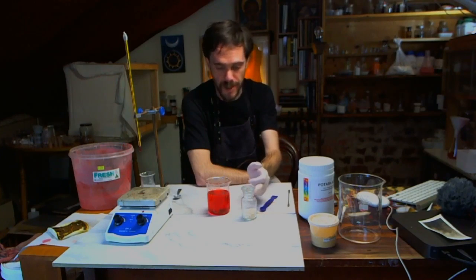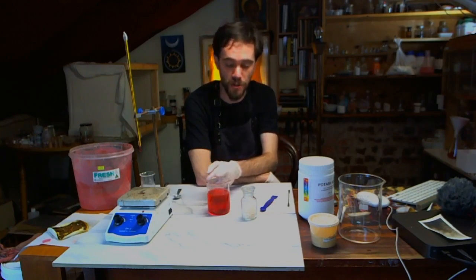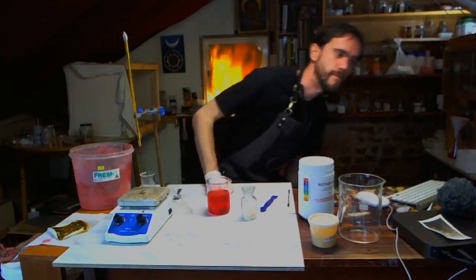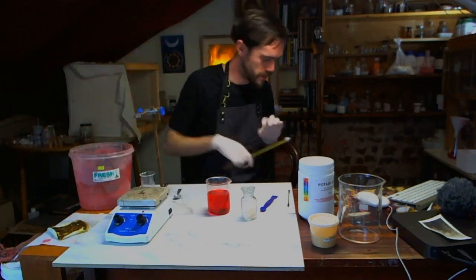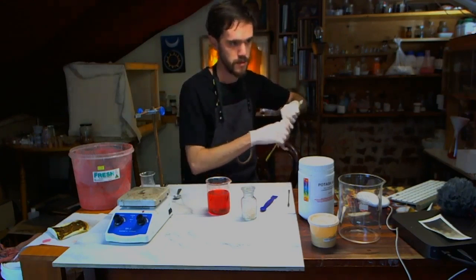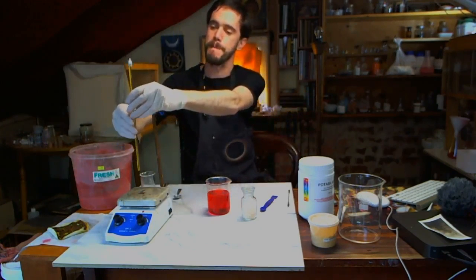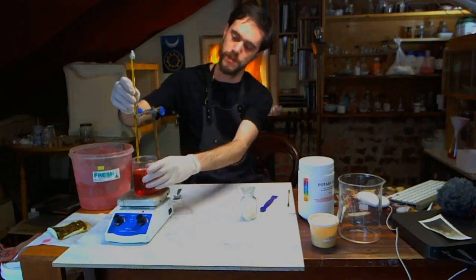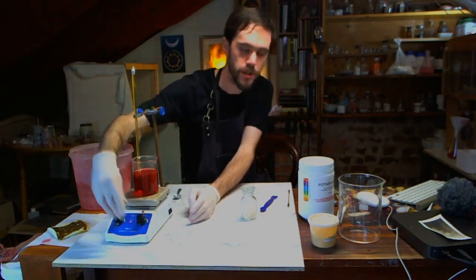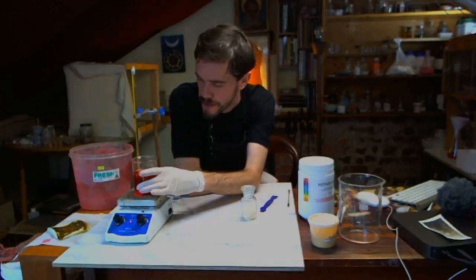So now we're going to add the lead acetate to this, and what will happen is we should precipitate out the sulfate, making lead sulfate. So let's clean this off. Thermometer. Get the temperature going. Currently the liquid is at 34 degrees Celsius.